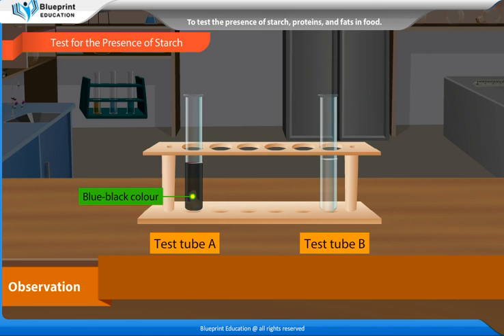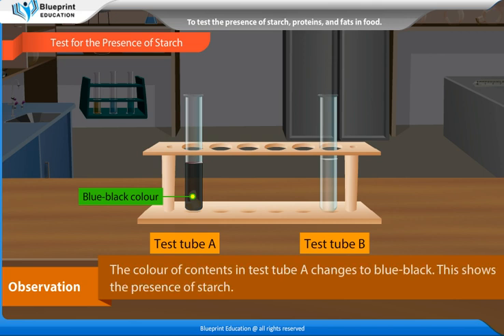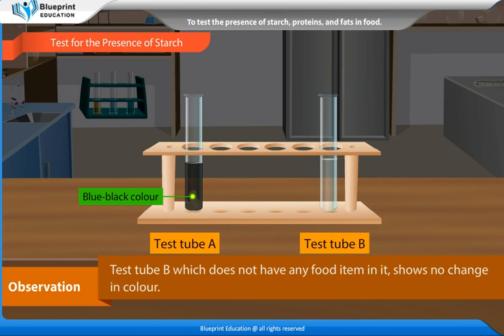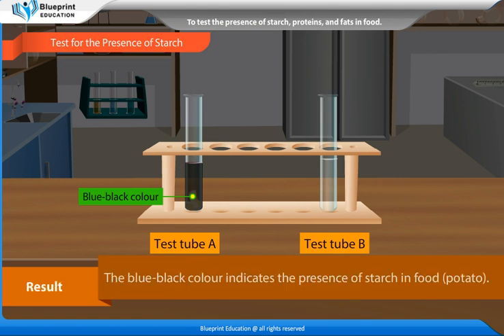Observation: The color of contents in test tube A changes to blue-black, which shows the presence of starch. Test tube B, which does not have any food item in it, shows no change in color. Result: The blue-black color indicates the presence of starch in food — potato.